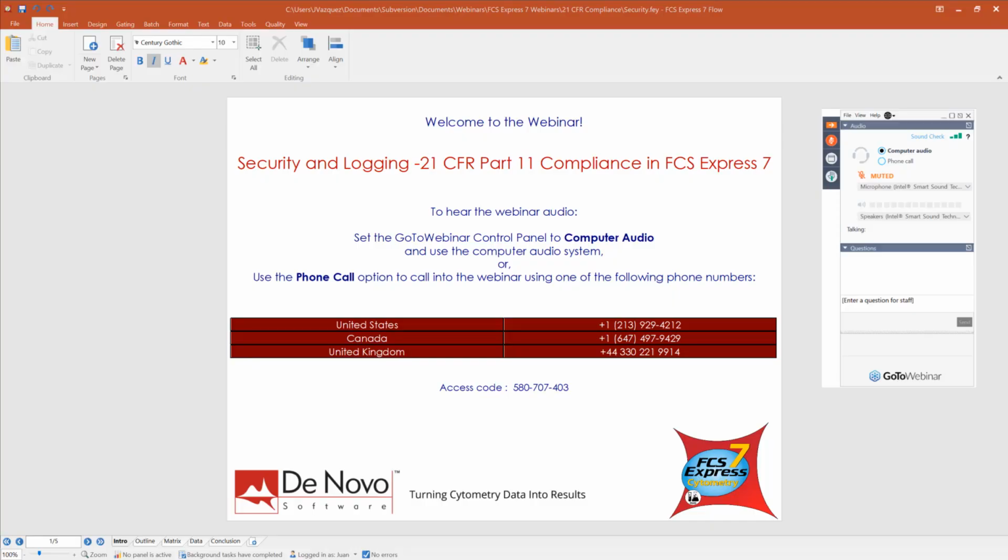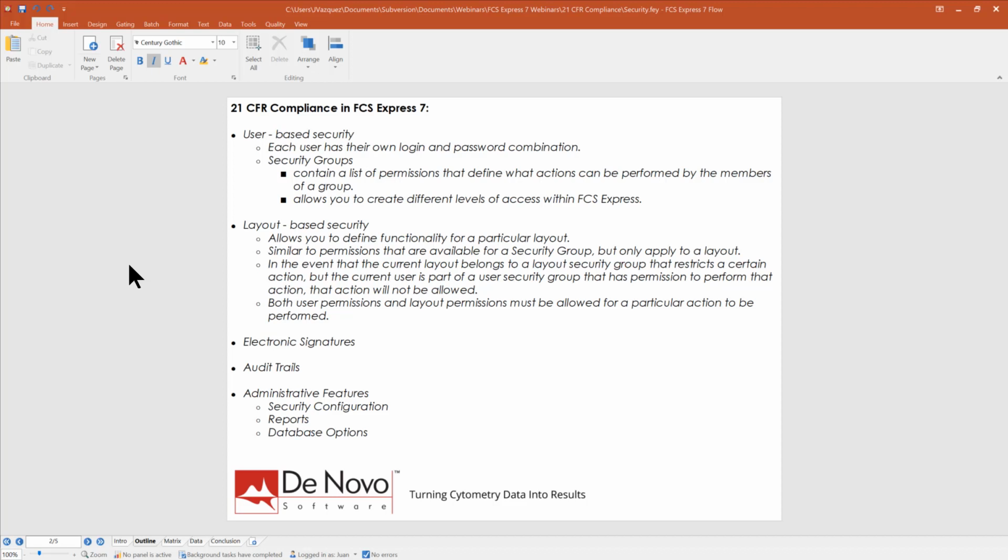Okay, so thank you for joining me in today's webinar, Security and Logging 21 CFR Part 11 Compliance in FCS Express 7. Today's webinar is going to focus on the features that are available in FCS Express to enable 21 CFR Part 11 compliance in your data analysis in FCS Express.